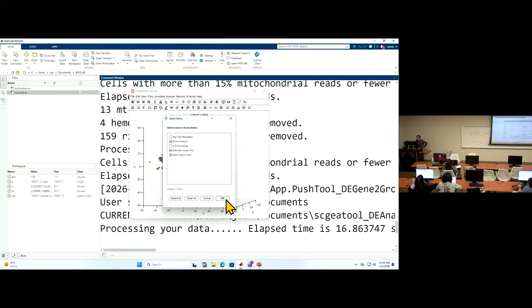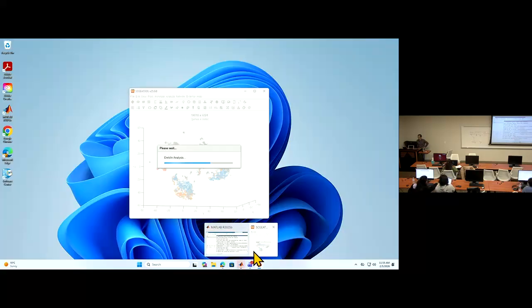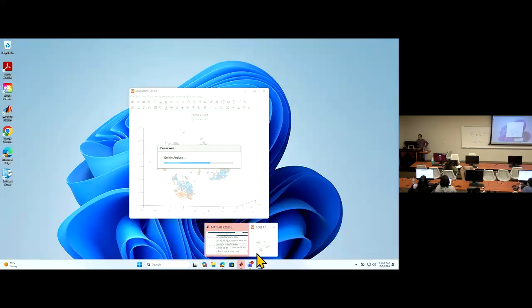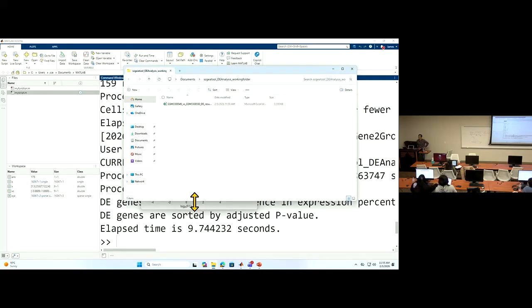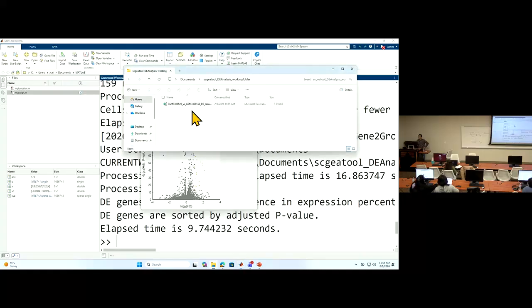You can do some of this next level of analysis, but at the end, you should get this kind of volcano plot to get the results. So this is highly expressed, upregulated, and this is downregulated when comparing these two samples.